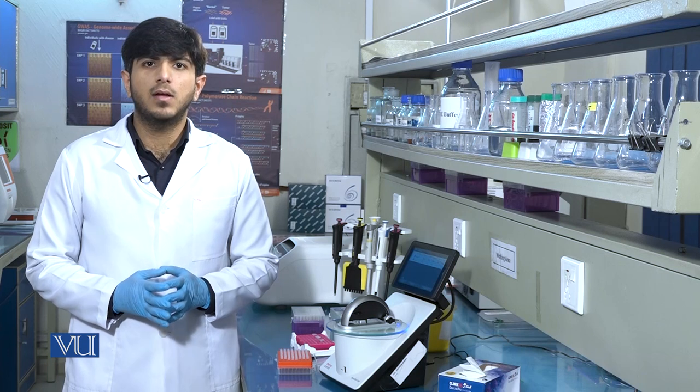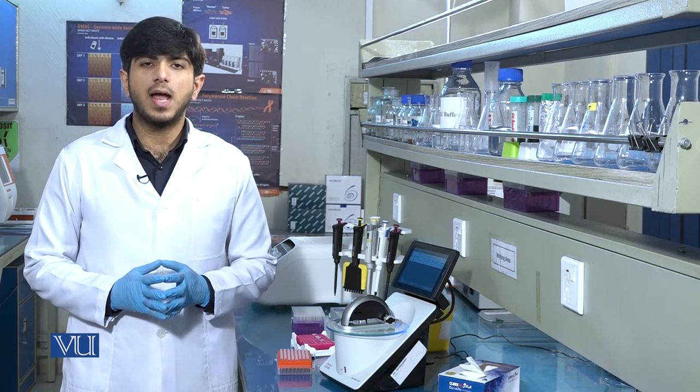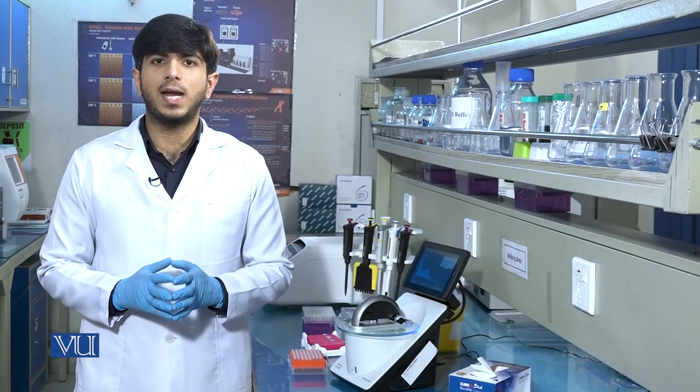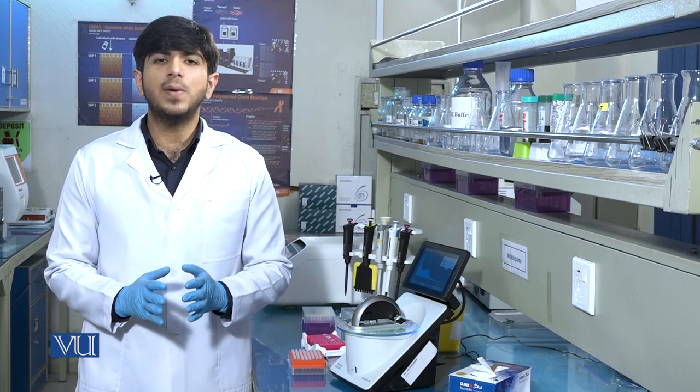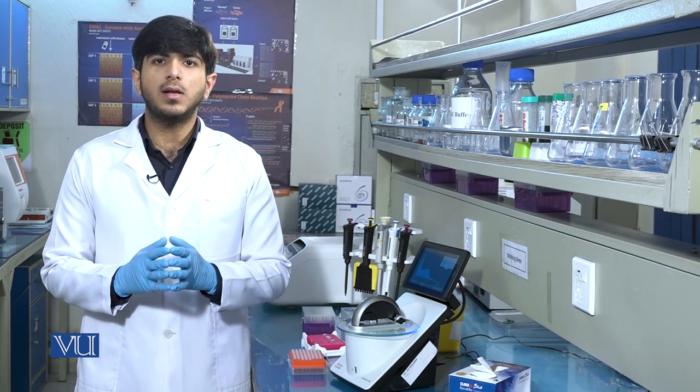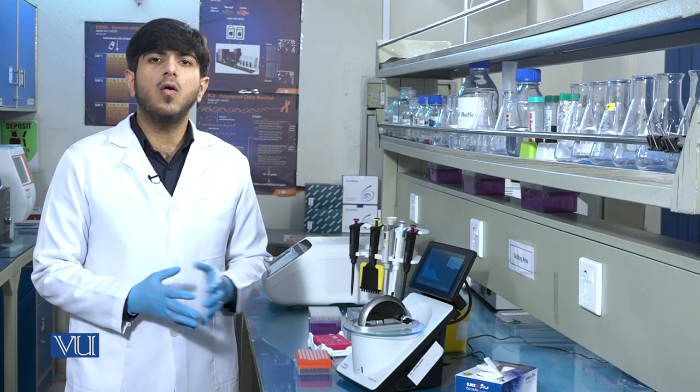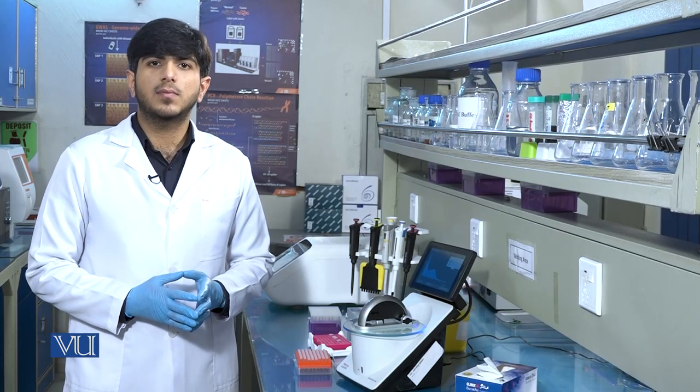Normally, there can be 3 types of contaminants in DNA: phenol, guanidine, and protein. If the value of the A260/280 ratio is 1.8, then it shows that the sample contains pure DNA. But you can see that here in these results, there is contamination of phenol or proteins, which shows how we can measure or assess the contamination through the Nanodrop spectrophotometer. So that's how we run multiple samples to measure the quality of DNA.